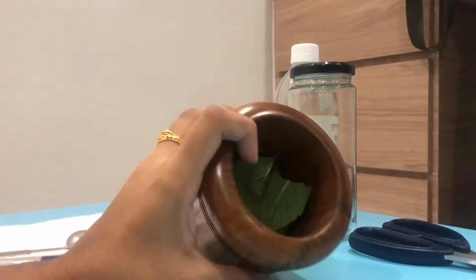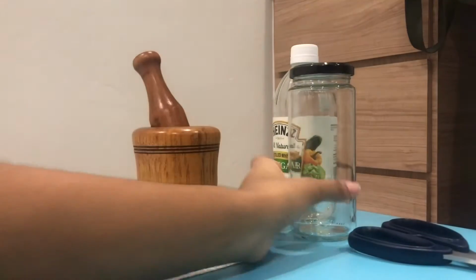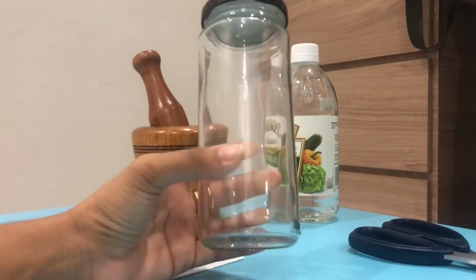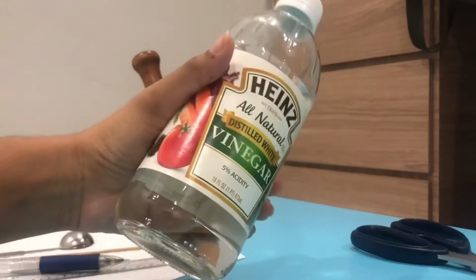Inside here are the samples that I'll be using, which are actually pudina leaves, and then I'll be working with the TLC chamber, or I'll be using a jar, and lastly to substitute acetic acid I'll be using vinegar.